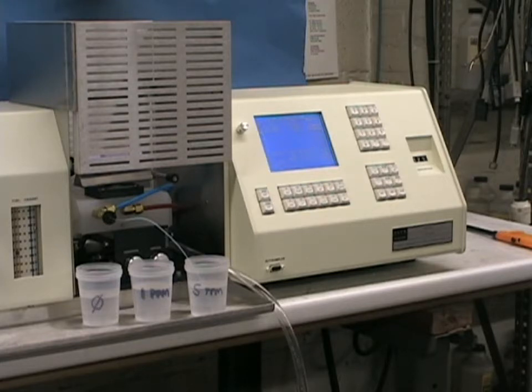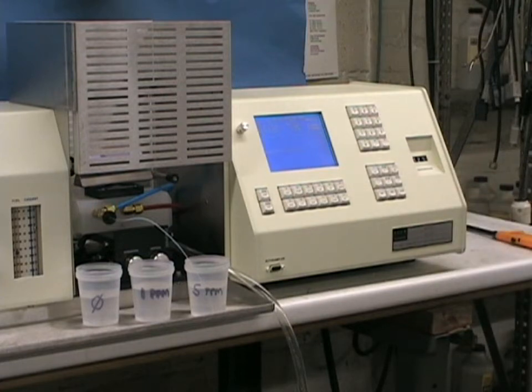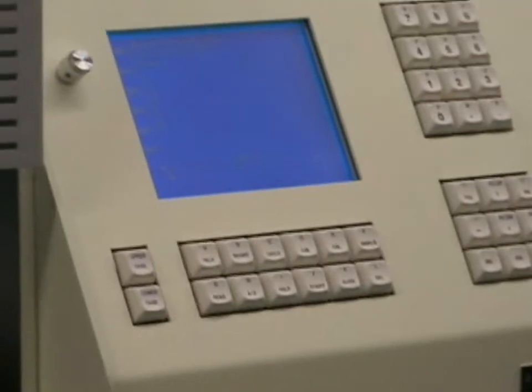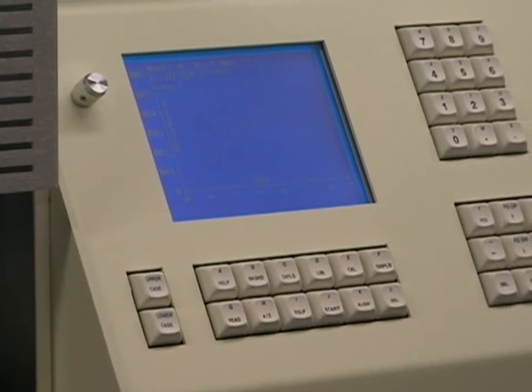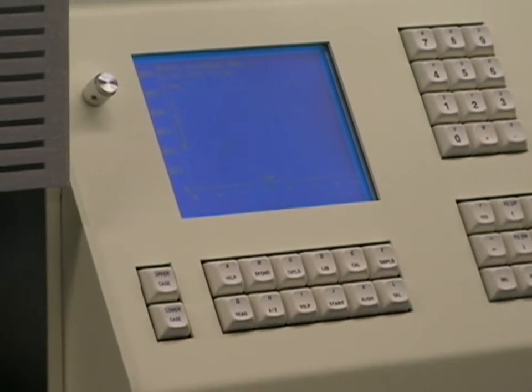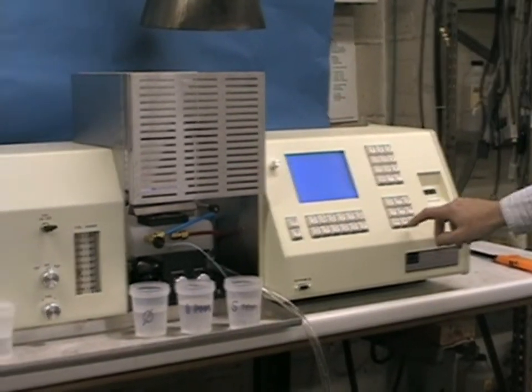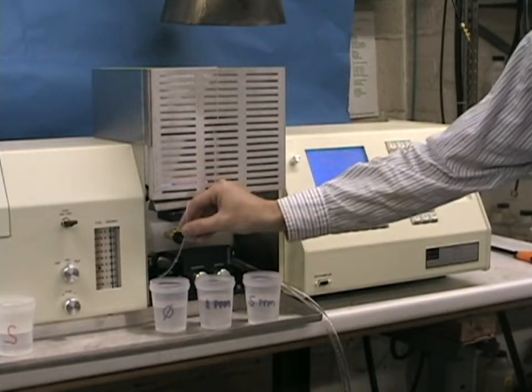When this is finished, we can press the Cal key, then the S key to see the calibration coefficients for the curve, and then Enter to actually see our calibration curve. As we can see here, we have mostly a straight line, although the software is capable of doing a second-order quadratic curve fit for any data points entered into the system. If you are satisfied with the appearance of the calibration curve, press the ESC button three times, which returns you to your active analysis screen.